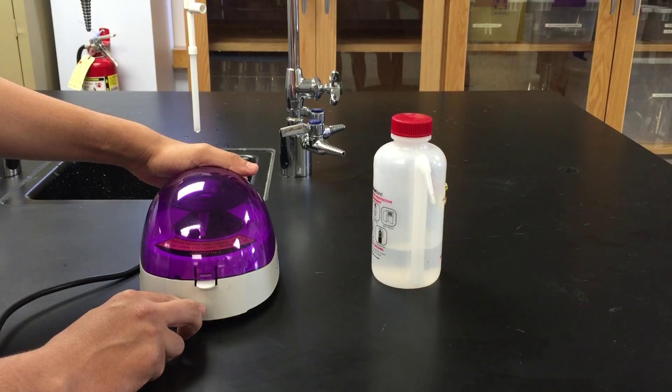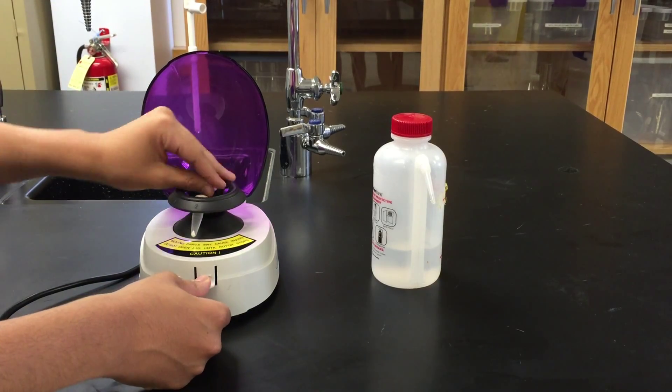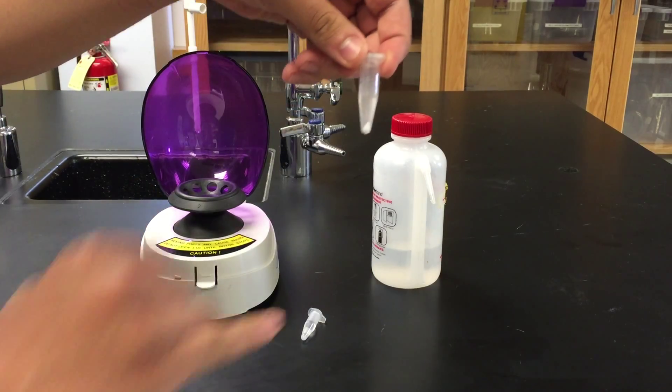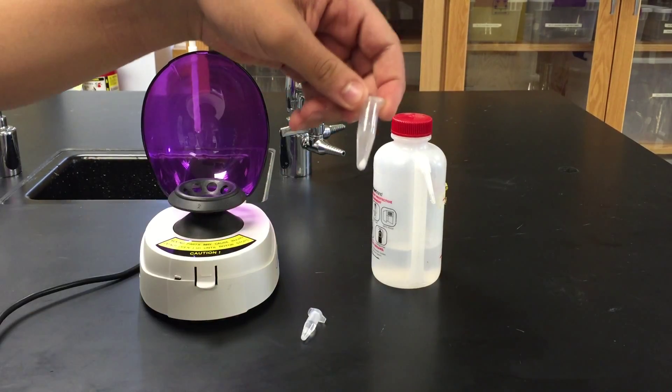After a couple seconds, turn it off and remove the two test tubes. You can clearly see that the precipitate has collected on the bottom, and what's on top is known as the supernatant liquid.